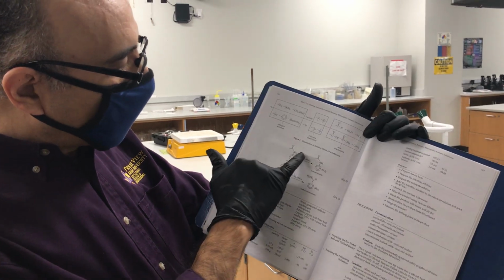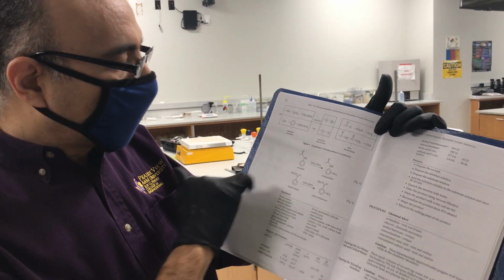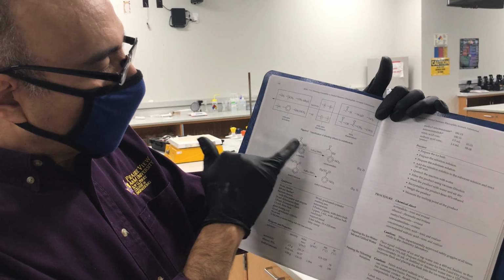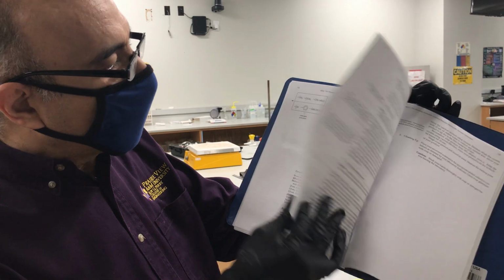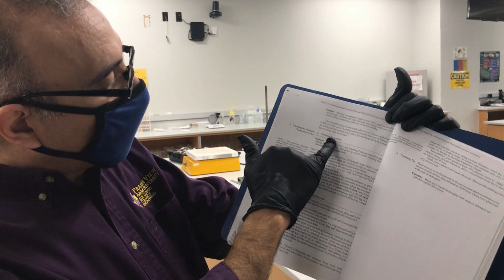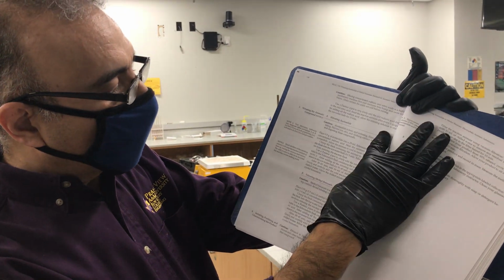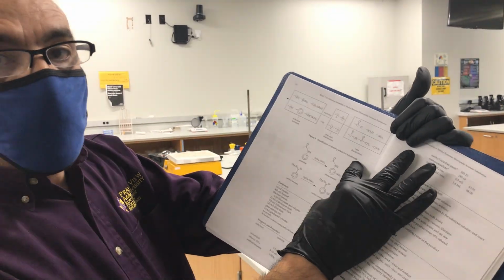First, we have to prepare the solution of sulfuric acid and nitric acid. We are going to use this solution to do the nitration of this compound and this compound. So basically, there are two parts here: nitration of acetanilide and nitration of methyl benzoate, and this is the reaction we are going to do right now.